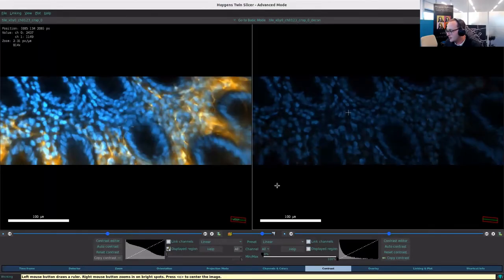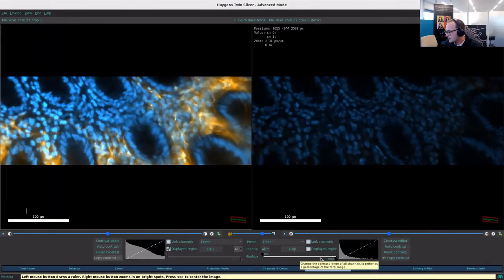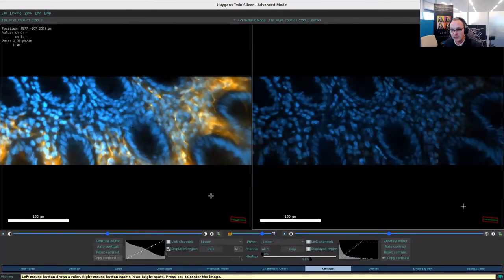Here we can see, if we look at the blue channel, let me just increase the contrast a little bit here. Is vignetting correction option included with the stitching module? Yes, the stitching module includes the position optimization and the vignetting correction. And we're making a lot of improvements for the stitching correction in this release. So stay tuned for the next webinar.